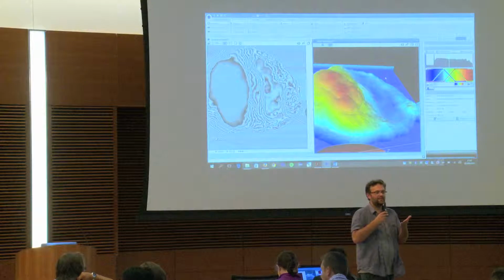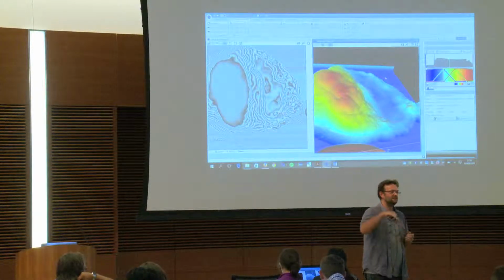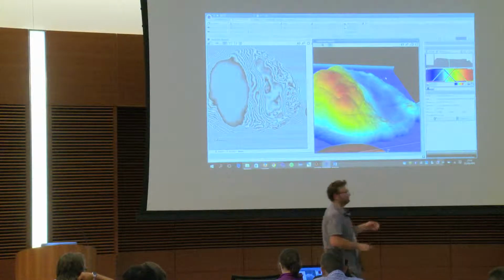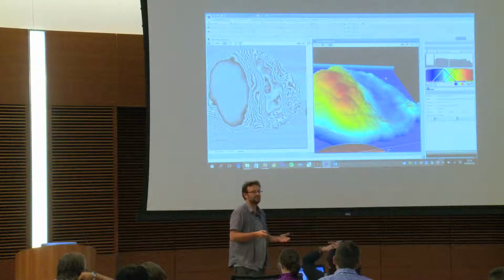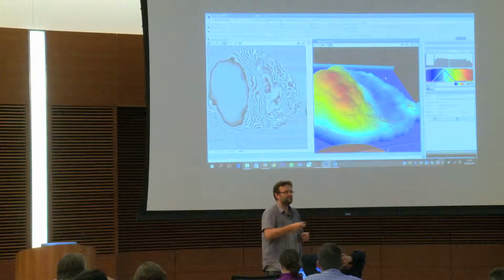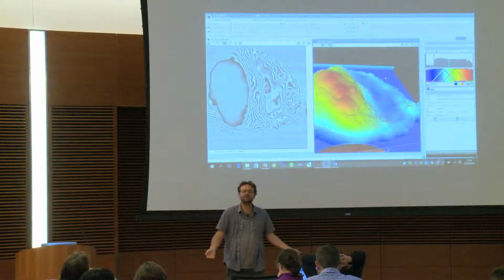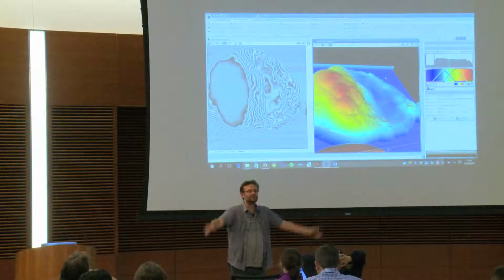So IC is created to help you understand deeply your images and navigate in them, and make Star Wars in your 3D stack with a plugin that is designed for this. It's not a waste of time. You can really see things that are funny. Okay, so we are done because we've been in 3D, and 3D is the ultimate goal.